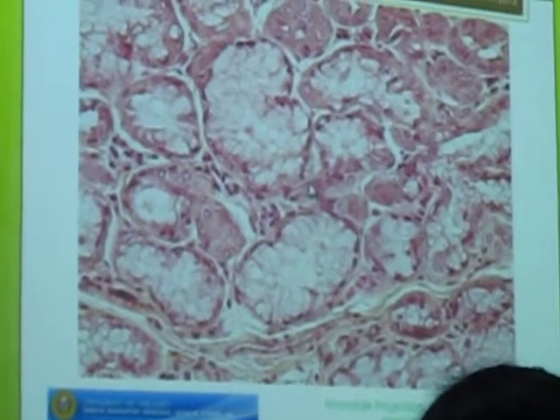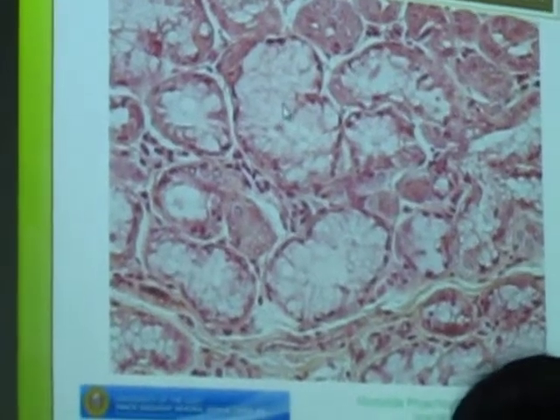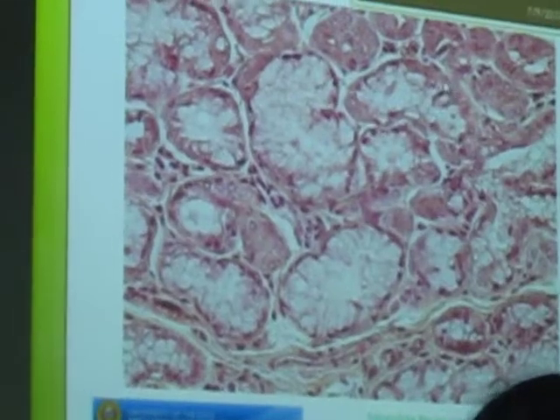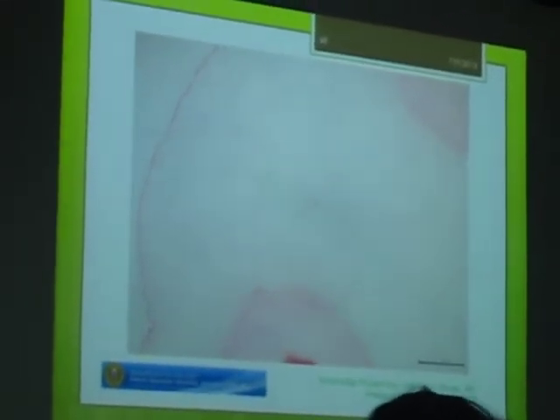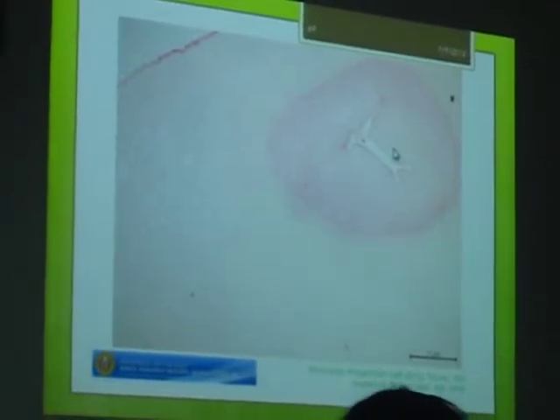According to the nature of secretion, mixed. Okay, mixed. You have mucus and you have serous. Okay, this is serous demilune. So this is a mixed gland. But it is taken from the esophagus. Alright, so this is a pale staining organ because of the type of the tissue. Okay. There. This is a clue.